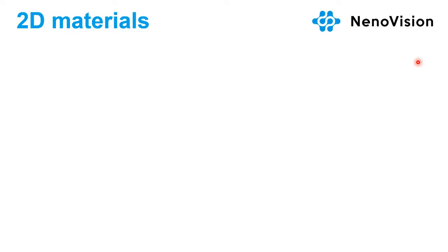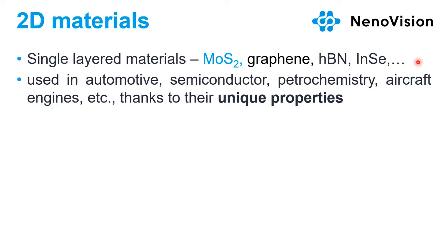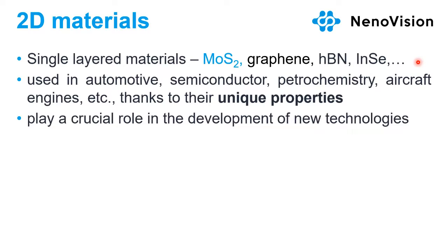Two-dimensional materials are quite a hot topic for a few years already. They are single-layered materials of different chemical composition, such as molybdenum disulfide, graphene, HBN, and so on. They are studied to be used in automotive, semiconductor, or aircraft engineering, and so on, because they have quite unique properties.